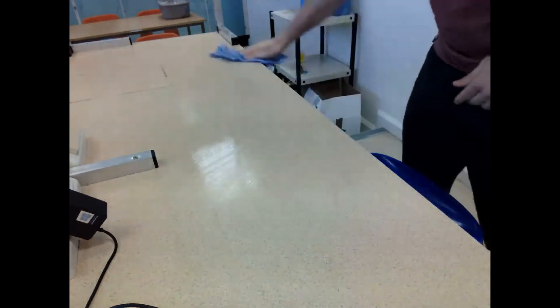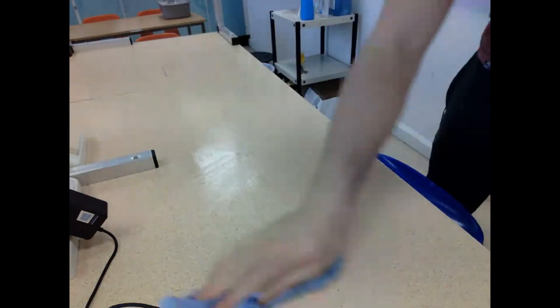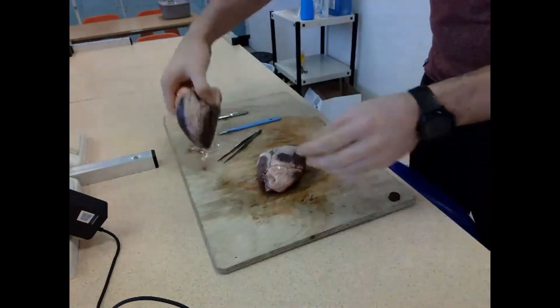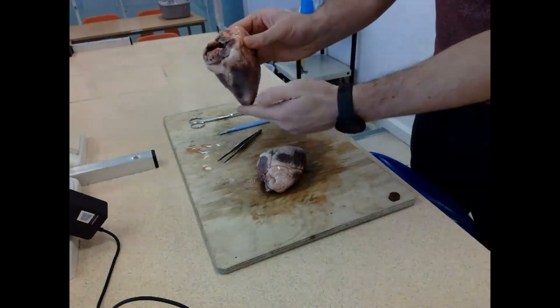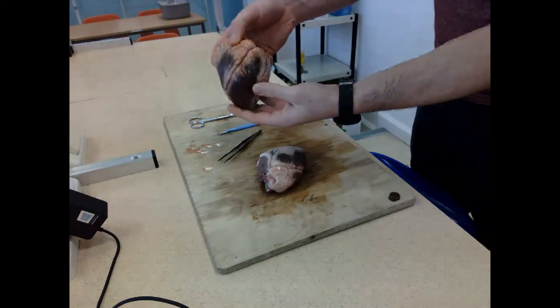I disinfected my desk in preparation to do this dissection, and once I was happy that the desk was disinfected, I got my chopping board, my two hearts, my forceps, my scalpel, and my scissors.